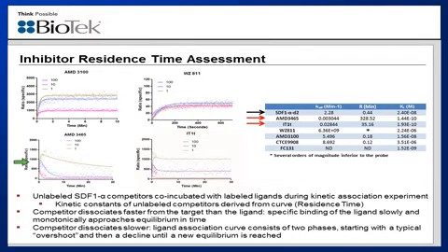Compounds whose residence times are greater, which we see by the residence times generated for these 2 compounds, again, values that are greater than that of the known ligand, which was 0.44 for the labeled SDF1 alpha, may then exhibit a stronger inhibitory response when used in the confirmatory phenotypic assay, which is what we went on to perform.